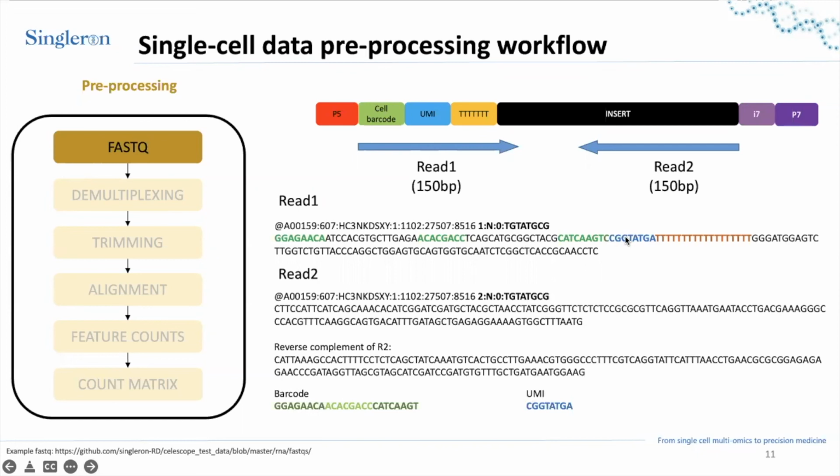Here I don't use any different algorithms to search for the UMIs as well as barcode, but I believe this may be overcome by using more speedy algorithms, for example, some greedy search methods to search for the UMIs as well as barcode for the identification of the match with the reads.